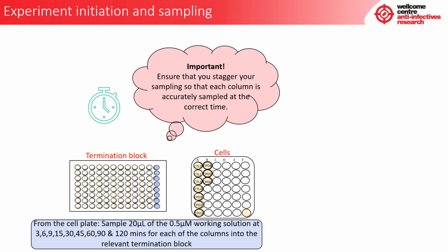It is important that you ensure that you stagger your sampling so that each column is accurately sampled at the correct time.